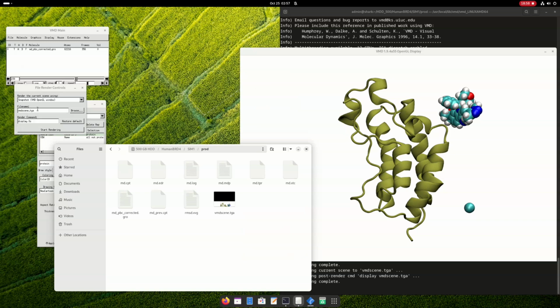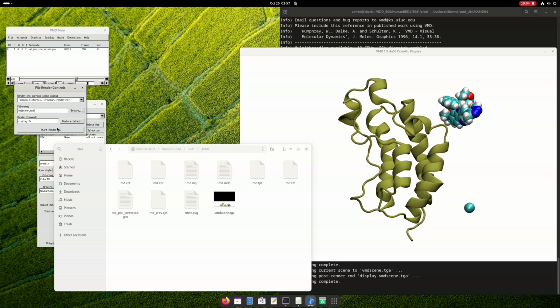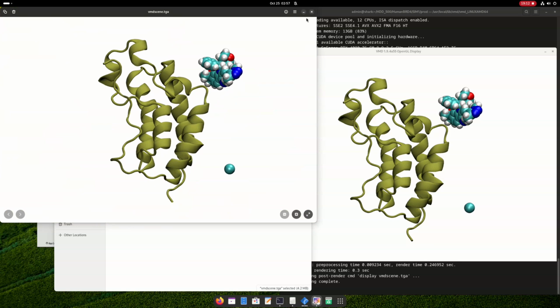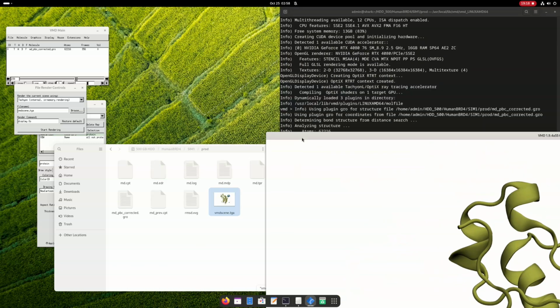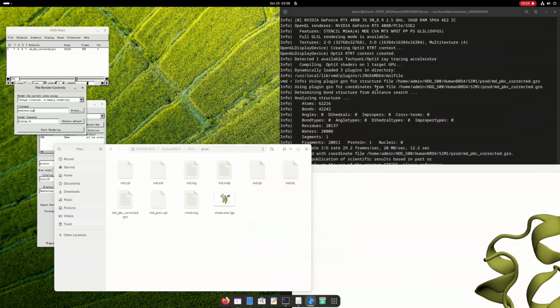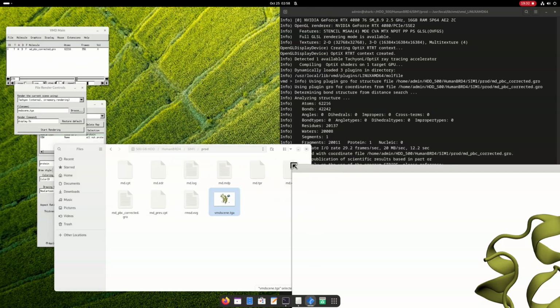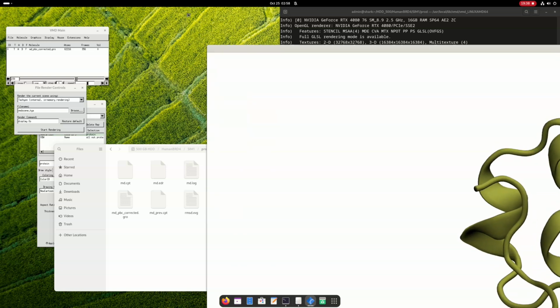Okay, so there are also other methods that you can use, maybe Tachyon, and this should also create some images. I think this looks much better than the snapshot one, at least in my case. Let's try once again with a little bit increased resolution. I think this would be fine for trying, and I think it looks much better than the last time. So this is how you get high quality images. Now let's increase this a little bit more, just to check if I can get some better images.